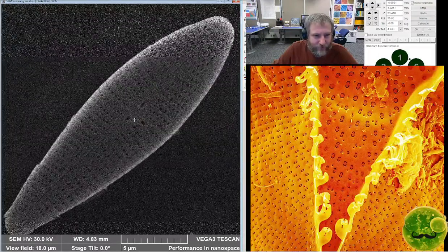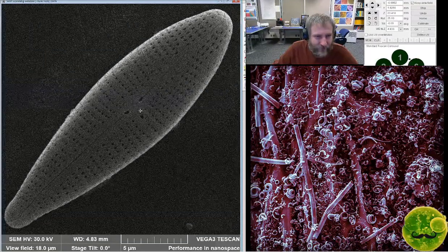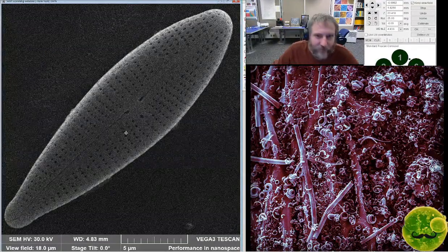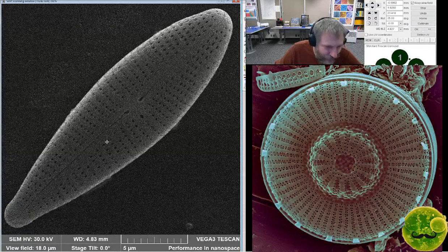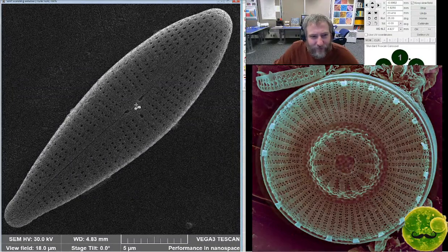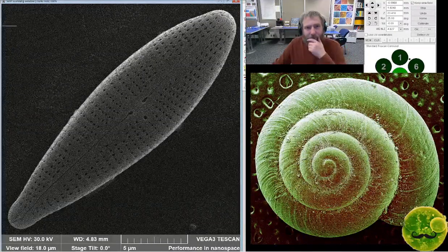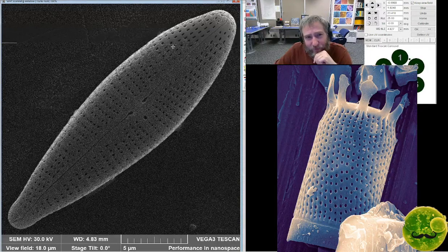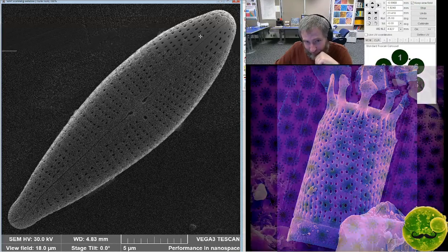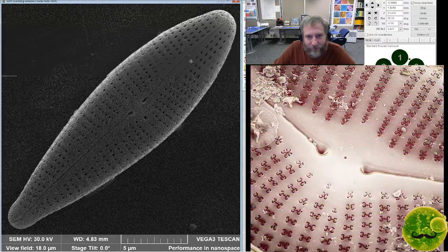This is an external view. It has sort of an Afrocymbella stigma. It doesn't look quite like a typical Gomphonema stigma, which is a little more central. There's some weird stuff in Africa, and at the genus level, I think we need to kind of explore the Gomphonemas a little bit better, because most of them don't seem to fit perfectly into Gomphonema the way we would like. This one has classic Gomphonema areolae, little ovals, sometimes slightly C-shaped, and the raphe bifurcates the apical pore field, but that is sort of an Afrocymbella-like stigma on that thing.